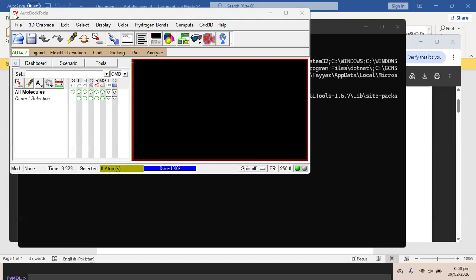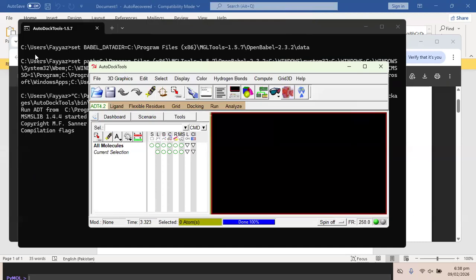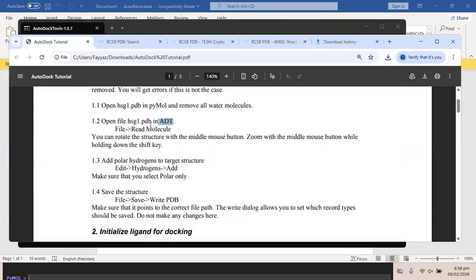Okay. Here, let me just move this screen. Okay, this is now here. Okay, let me go to what we need to do.